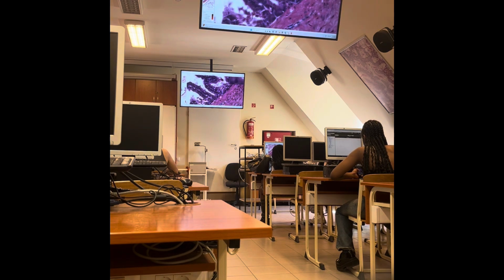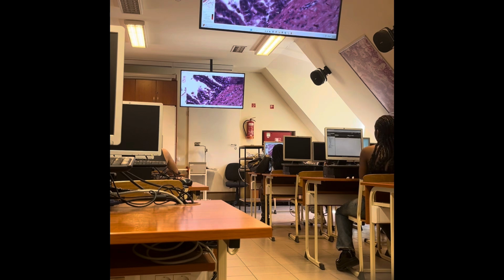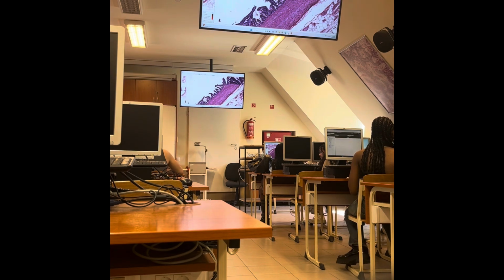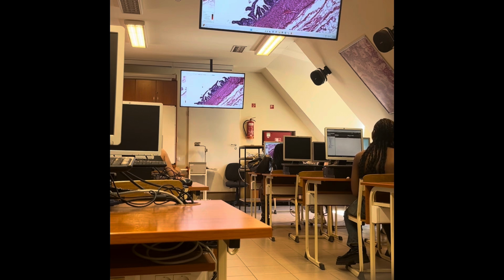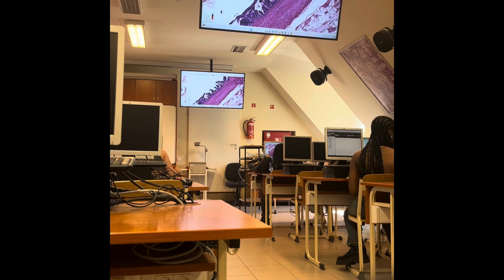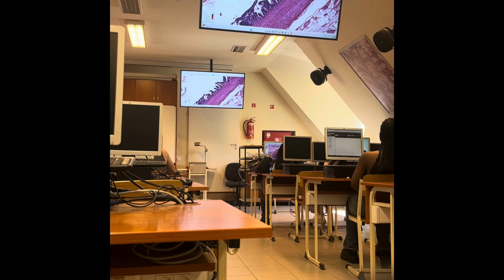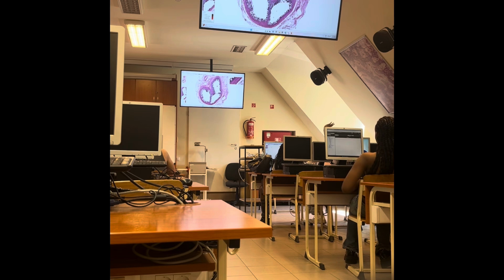Here you can see nicely the columnar cells, and then it changes to cuboidal cells at the base of this fold, and then again columnar cells. So this is secretory epithelium. And then the muscle layer, as I told you, is not so regular, but it has an inner circular and outer longitudinal sublayer. Sometimes you can see some interwoven smooth muscle components, and that can disrupt the regular layers of the smooth muscle. Okay, so this is the seminal vesicle.